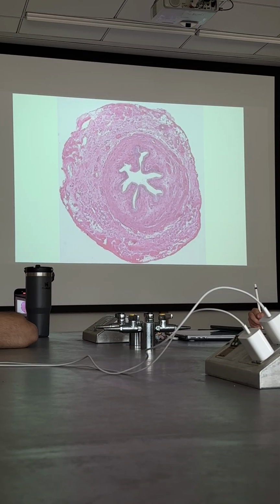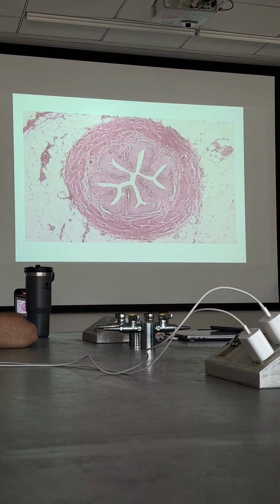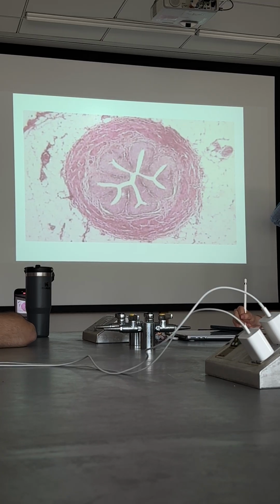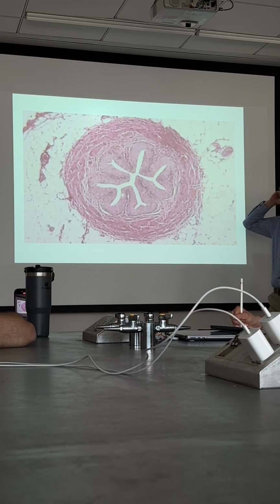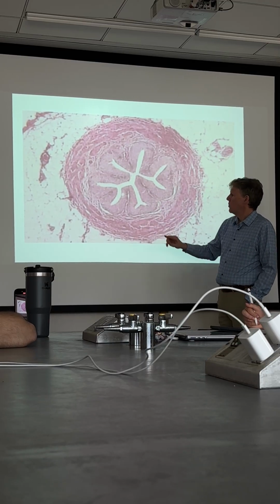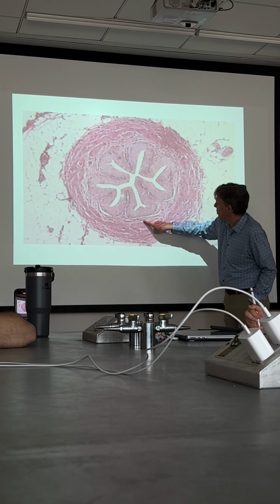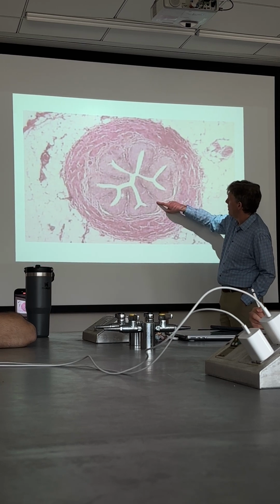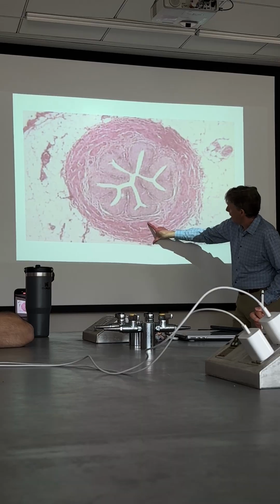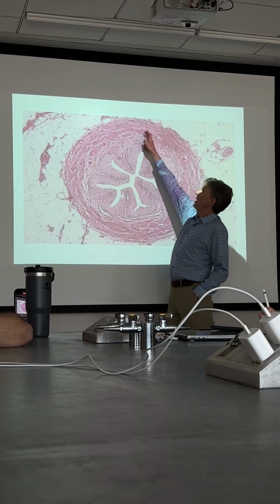Here's a photo where they kind of removed the adventitia. I mean, technically, it would be this fat tissue and other stuff that's around here. So on this one, this is the transitional epithelium. The lamina propria is kind of squeezing its way in this area or in between some of the epithelial layers, so that would all be lamina propria. And then the rest of this out here is the muscle layer.